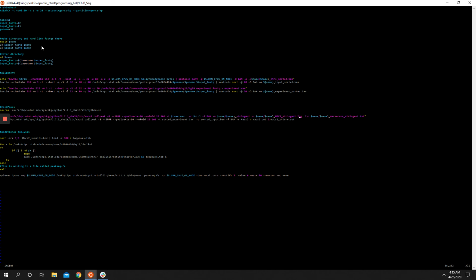Now we can go down and do the same thing for our MACS2 call. So we can say $name_experiment_sorted.bam.